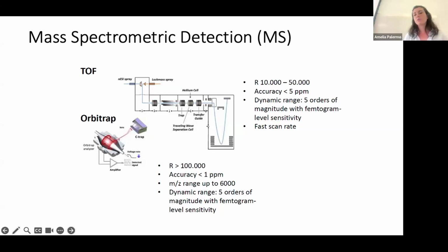Or is it going to give you a combination or a partial combination of those peaks? That is very important in proteomics, because in proteomics you have multi-charged peptides to measure that make the peaks you detect be apart from each other by fractions of 1 unit of mass. For instance, you can have 0.5 distance, 0.25, right? Fractions of that, depending on the charges. And in that case, you really need resolution to resolve those clusters of peaks.